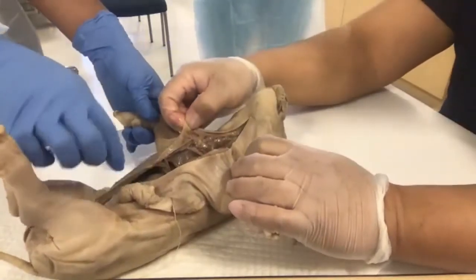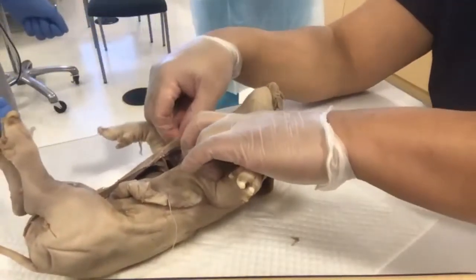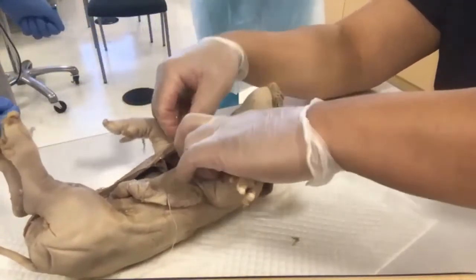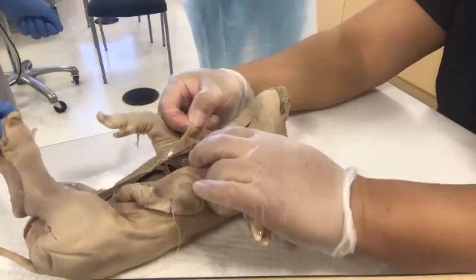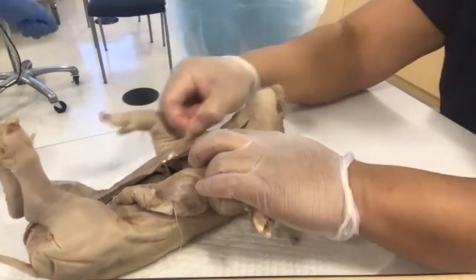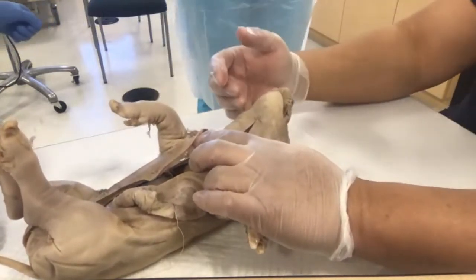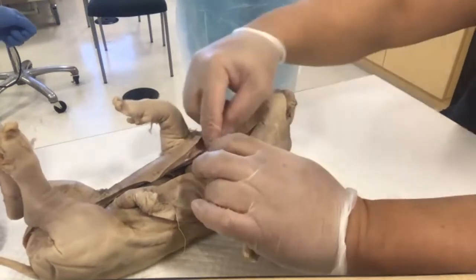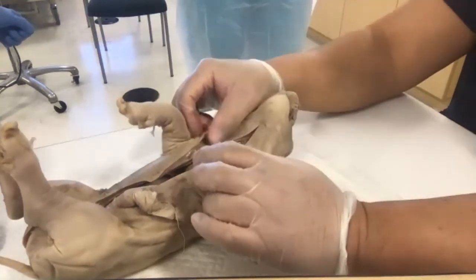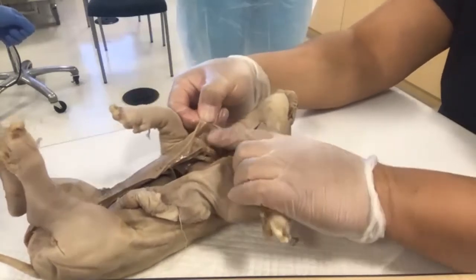So remember the layers of the skin. And here's a nice trick. See how I can separate it? And there's not much fat on here, but you could see the epidermal layer, how tough it is. So remember what I mentioned in lecture? Everything on the outside is a lot tougher than everything on the inside, and it makes sense. So skin is a living, breathing thing.